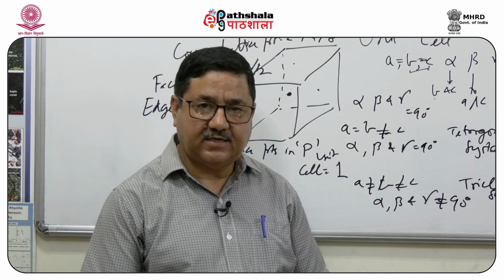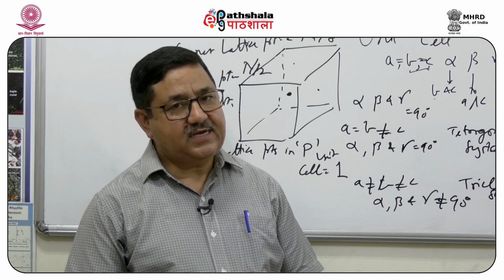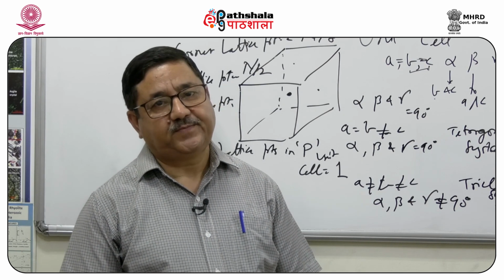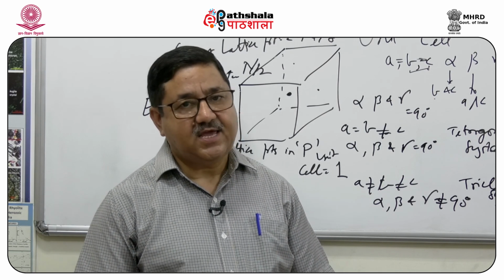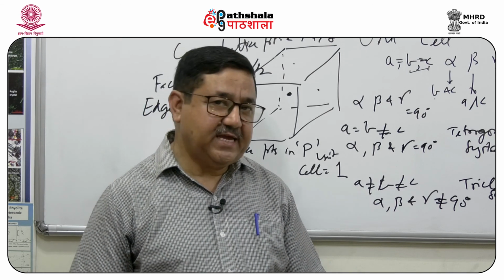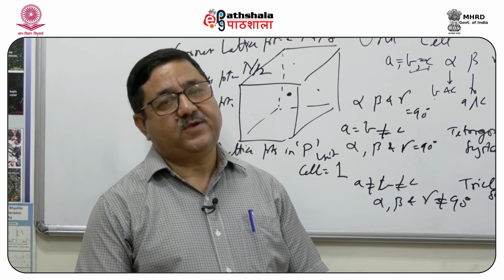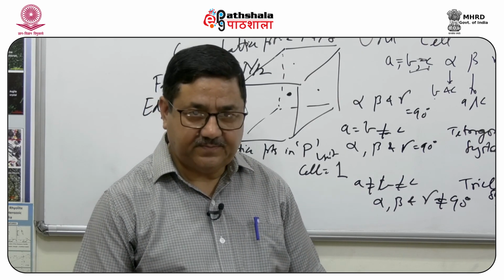For X-ray diffraction, we use a monochromatic X-ray, and the interaction constrained by the Bragg's law of constructive interference produces the crystal planes, which we can index, measure and characterize in terms of their crystal structures, which in some cases can be used as fingerprinting for those minerals, and in other cases can be used to deduce other crystallographic parameters of that material. Thank you.